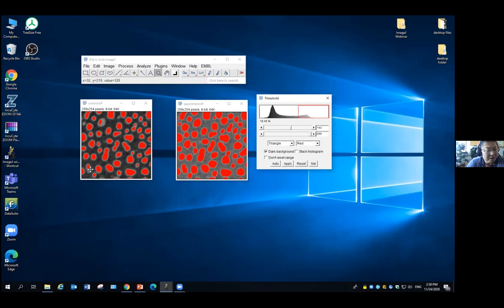Okay? Because you cannot really control the condition of your sample, maybe under one condition your sample just has a higher background. A single value thresholding doesn't work for all the images. By my experience, it's very rare that images under different conditions going through the imaging process can have exactly the same thresholding work. But if it's just the background change, the thresholding method can actually work very well to compensate for this.